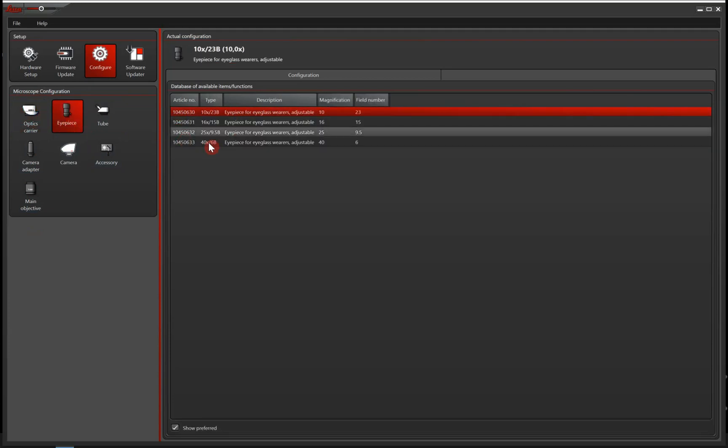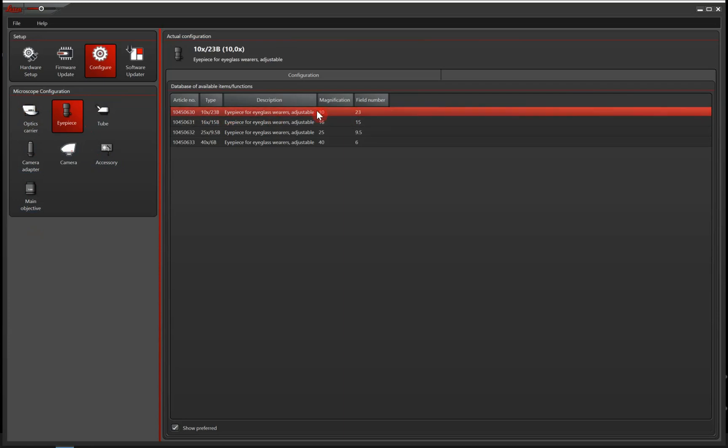Then we can move on to eyepieces. Typically, we have 10x eyepieces. So let's say we have that in this case. It's already marked.